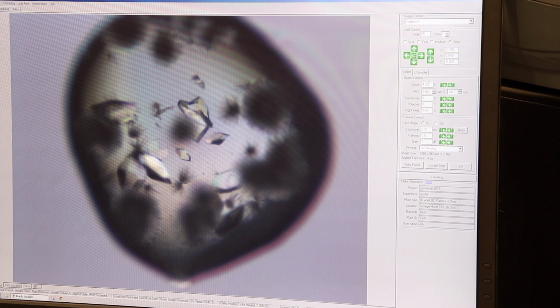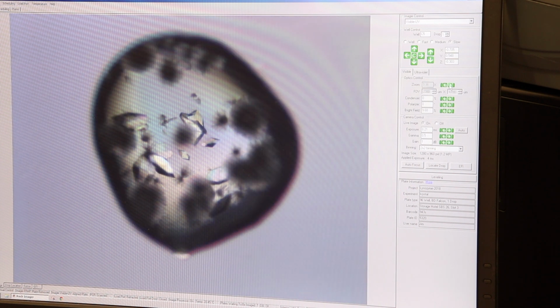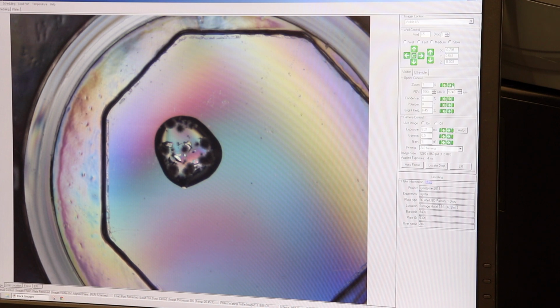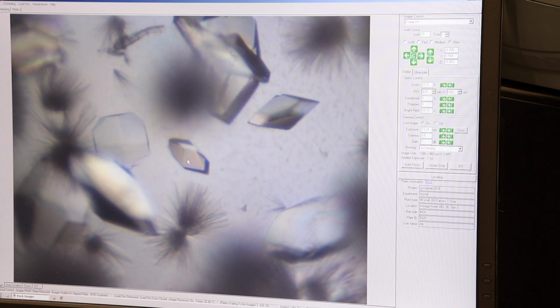And now let's go in with the zoom. So you can either use the arrows to zoom out or to zoom in. The little boxes at the edge of each arrow indicate the minimum and maximum. So if I want to go to minimum zoom, which is 1, of course, it's zoomed all the way out. And if I want to go to maximum zoom, which is 11.3, we hit there. So let's take a look at this guy a little closer. Again, auto is going to get the exposure right. And we'll center on that.